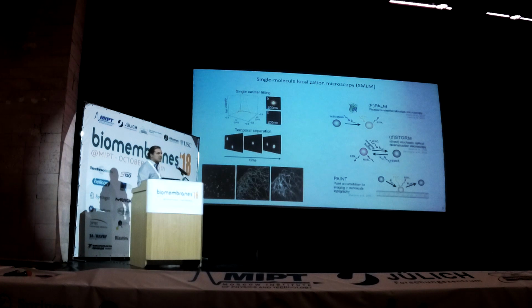But just to have us all on the same page, we are using single molecule localization microscopy, and Marcus has introduced this technology. What we basically do is we do not record a fluorescence image at once in one shot with a camera or scanner. Instead, we collect a huge stack of images, thousands or tens of thousands of images. And in those images, we make sure that we only detect single fluorophores.